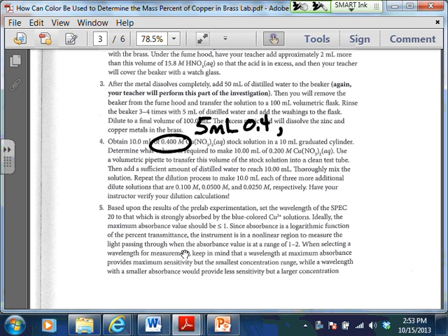So you'll end up with 5 milliliters of each one. You'll end up with 10 milliliters of the 0.025 at the end, okay? But 5 should be plenty because all you need is just enough to fill one of those cuvettes so you can measure the absorbance, okay?